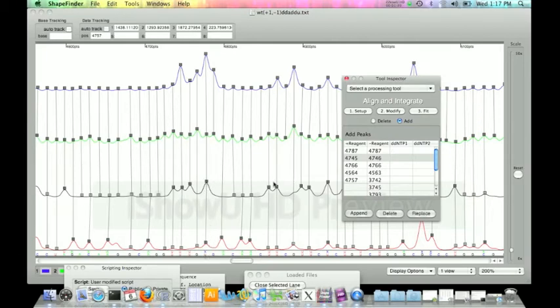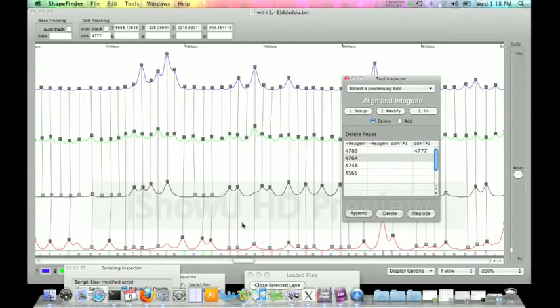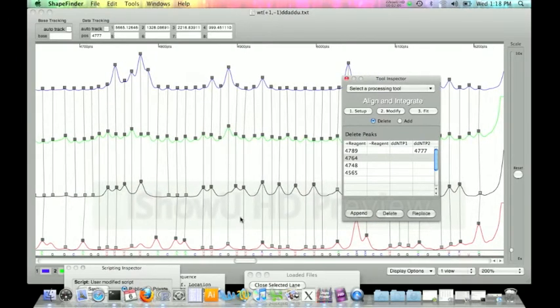Basically what you can do is override that by deleting one of the peaks in the certain ladders. And since I know that this position right here is a U, considering that the DDA peak is very strong, the DDU peak isn't so strong, and the sequence itself lines up all around the positions, we know that it's U, U, U here. So we know that this position is a U. So I'm just going to go ahead and delete this box off the DDU ladder. There we go. Beautiful. So now you can see if you add in a couple peaks here and there, it really can help the alignment of the sequence itself.